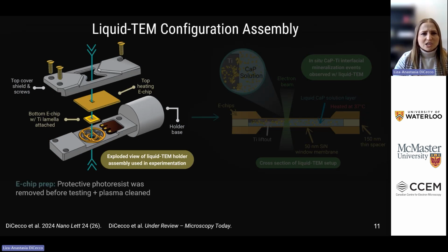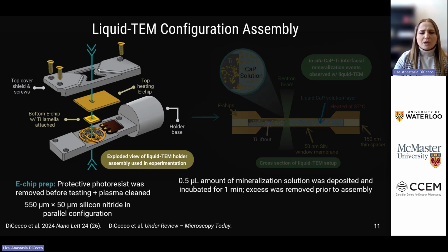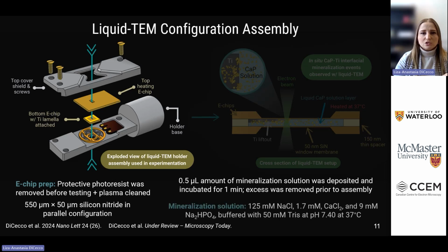This is pretty standard. We did remove the photoresist before FIB, but we freshly plasma cleaned the E-chips right before Liquid-TEM assembly. We're using the two E-chips in parallel configuration to maximize our viewing area. We added about 0.5 microliters of our mineralization solution before assembly and incubated for about a minute before removing excess solution prior to putting the enclosure together.